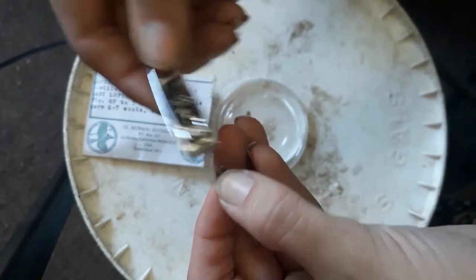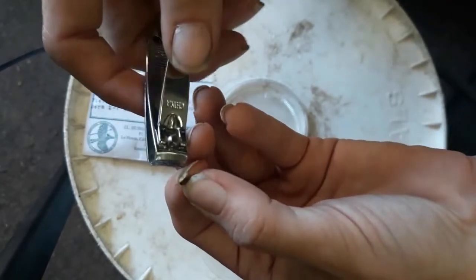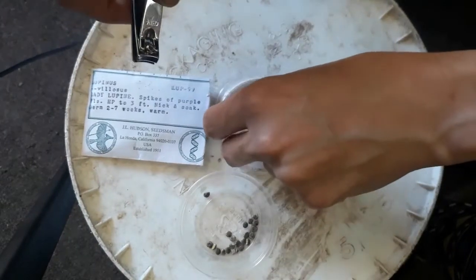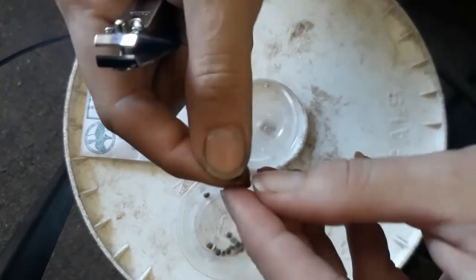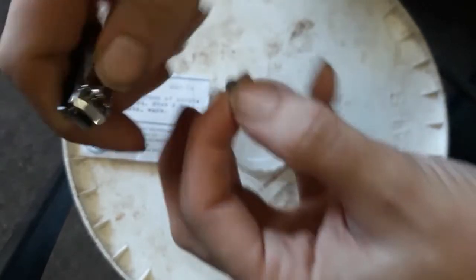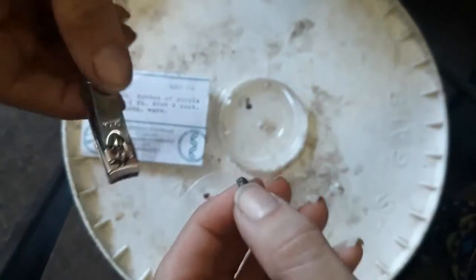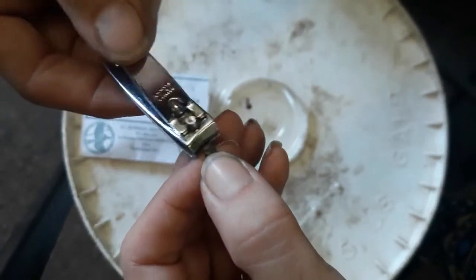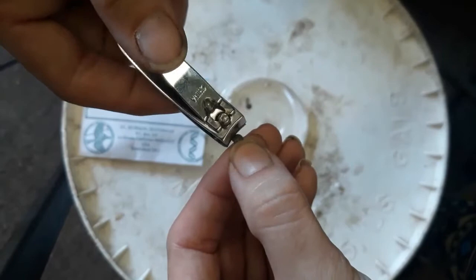There we go — we just clip and now we have a wound where water can get in. These will be nicked and soaked; the other ones will be just soaked, and we will use regular tap water. Again, we're going to take and get that little piece right there and just clip that off.